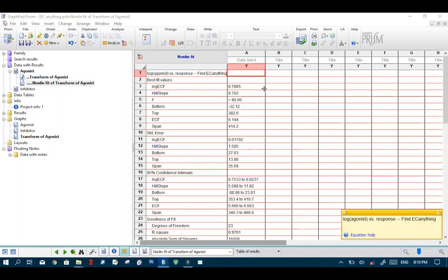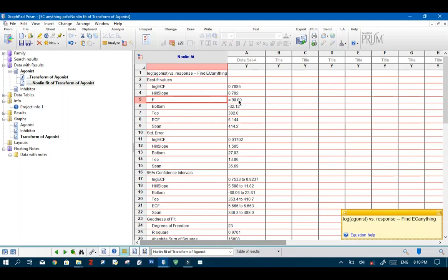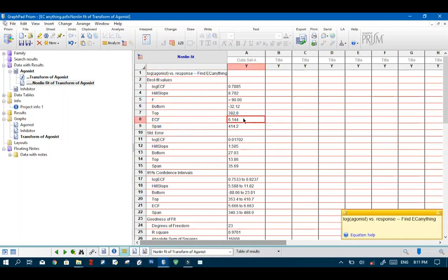Immediately GraphPad Prism returns our results. So as we already know our F value is 90 and this is the value we are looking for. This is the concentration at which our compound will give us 90% response.